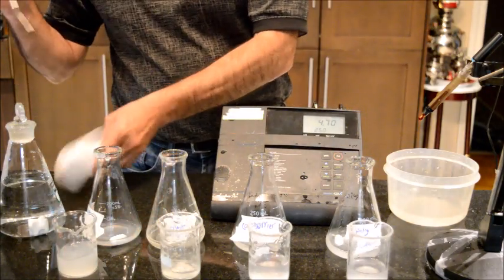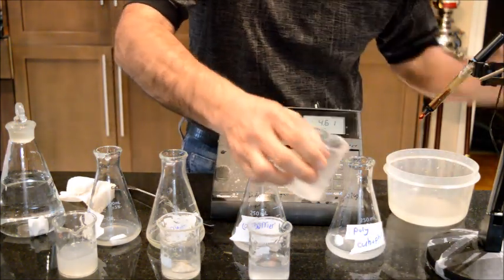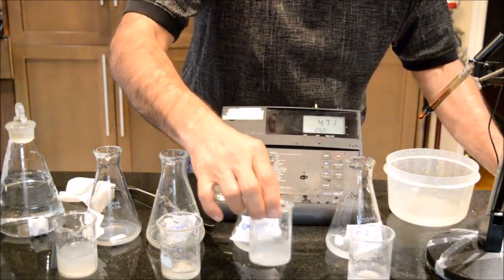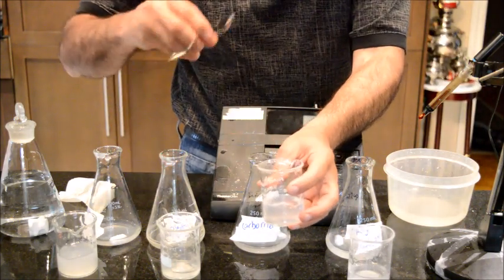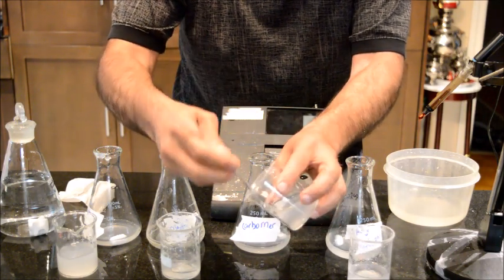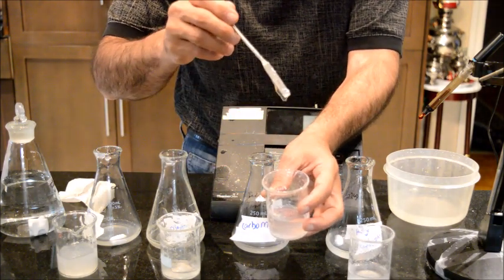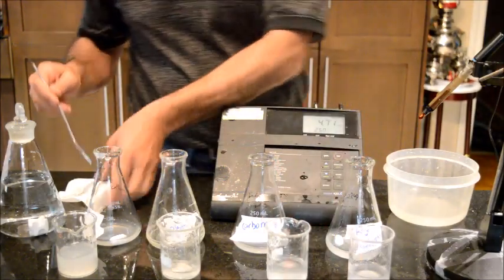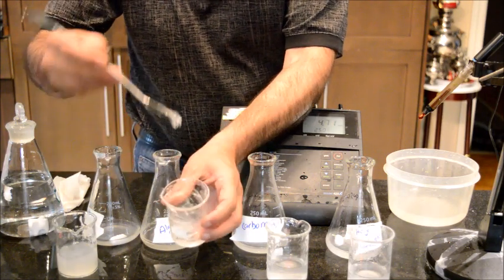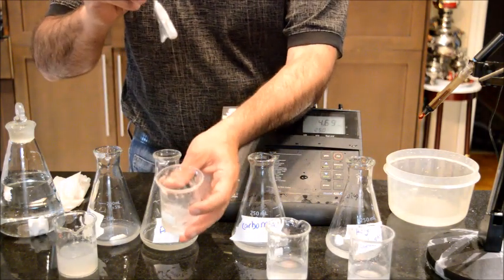So what happens here in the case of Polycarbophil, I have pretty much a liquid formation now, very low viscosity. Similar with Carbomer, that used to be an extremely thick gel, now it is becoming some sort of liquid formation, maybe more viscous than the Polycarbophil, but definitely liquidy. But in case of sodium alginate, I have a very thick gel forming, extremely thick.